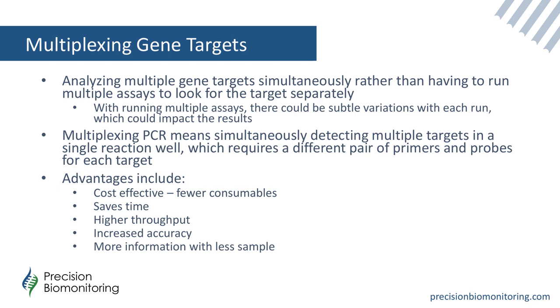Basically, you'll be looking at a different fluorophore, a different fluorescent marker, for each target. And the instruments, if they're set up to do multiplex detection, will actually have a different filter that reads that fluorescence in different, what's called channels, essentially. So they're set up for wavelengths of excitation and emission to separate out those fluorophores from each other, so that you can look at 3 or 4 or 6 fluorophores at a time, just depending on the instrumentation and the test design.